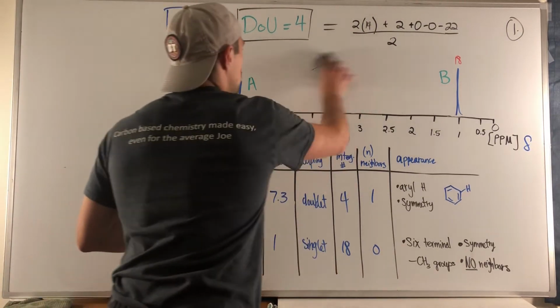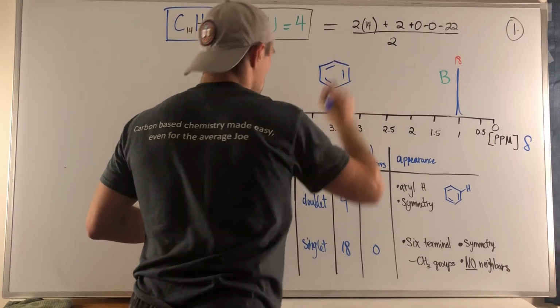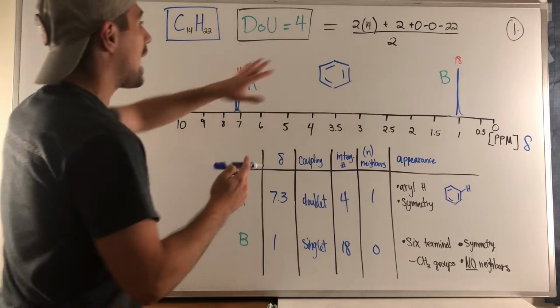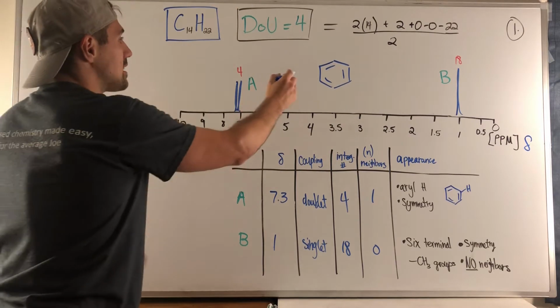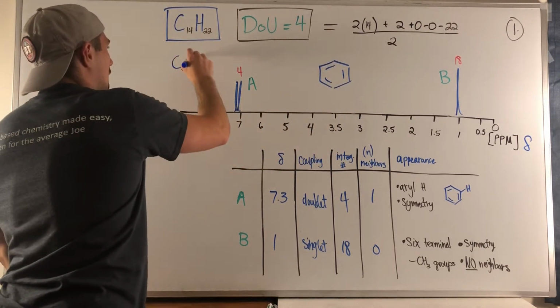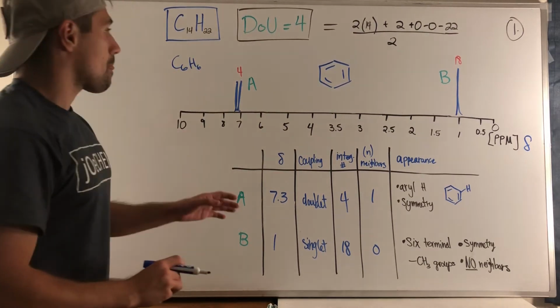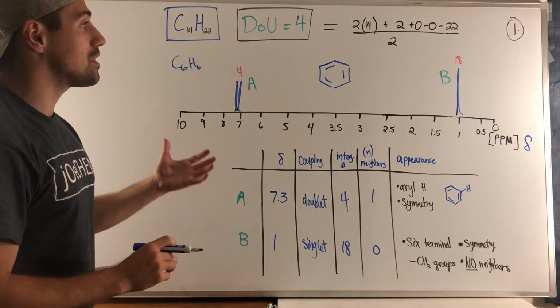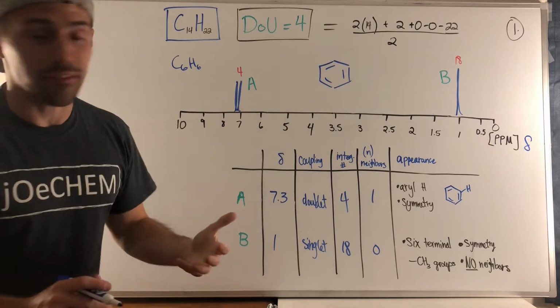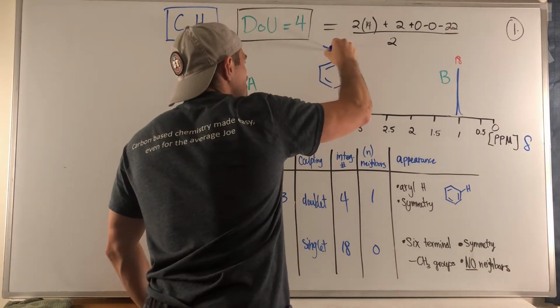So I'm going to give myself a little bit more space. I'm going to draw a smidge up here. We also need to make sure that when we place these extra carbons, that takes care of 6 carbons and 6 hydrogens as well. So we need to fill in where we think these t-butyl groups go and also make up the difference with our carbons. We have 8 carbons left, which is great because we were talking about potentially having something like this.